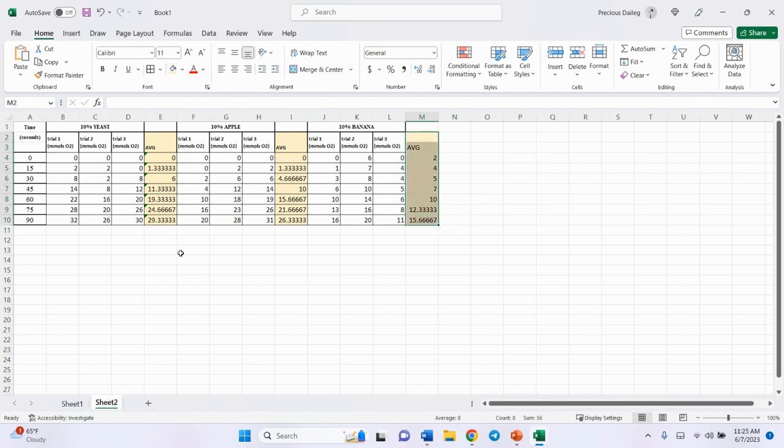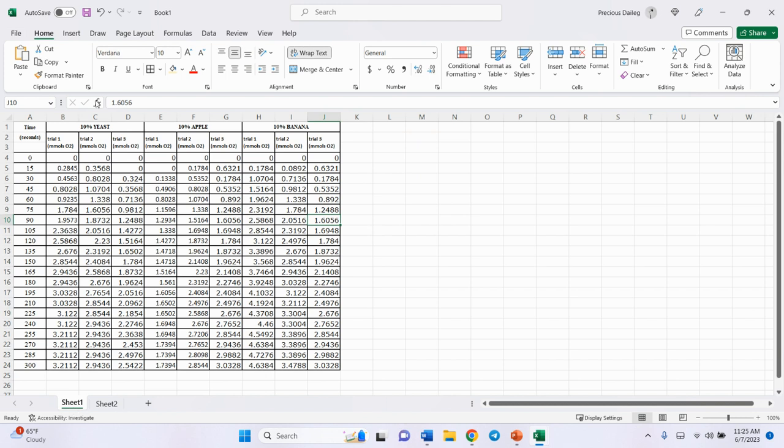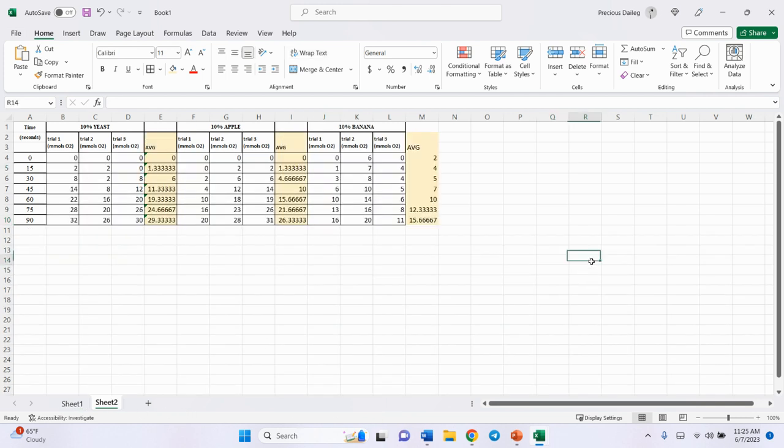So just these guys, right? These are the values that we're going to make a graph out of. So when you go to do your big data set, there should be each column in between just like we did, and then that's what we're going to graph. If you're proficient in Excel, you can graph it here. You would just have to select this one, this one, this one, and this one. Oh, I forgot one right there. So you can select those and make your graph.